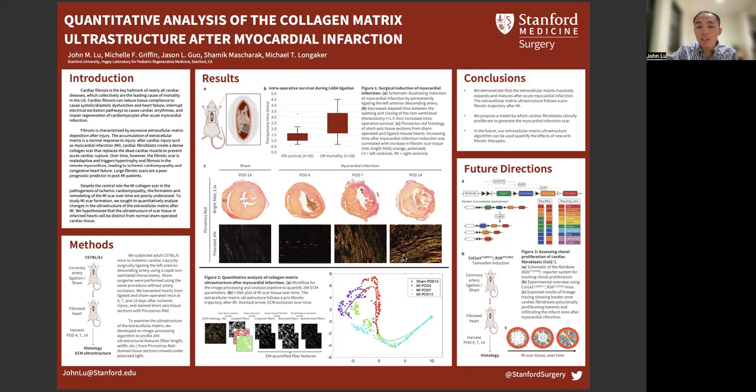And what we can clearly see under these images is that there's a clear progression in the quality of the collagen matrix ultrastructure. We wanted to quantitatively analyze this. And the way we approached this was we took 200 images in total. We took these images and then color deconvoluted them into 3 different channels, and then subsequently binarized and skeletonized these images so that a computer could understand and read them.